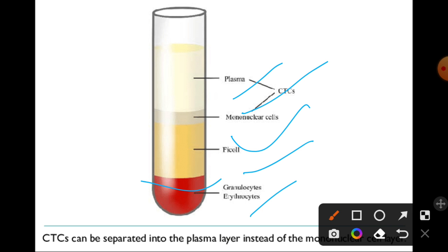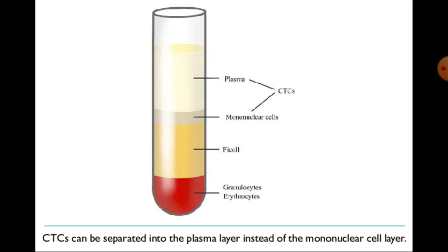And another thing I want to mention here, that suppose in case of plasma, the local density of the solvent is exactly equal to the density of the plasma. Okay, that is kind of the concept we have learned in case of isoelectric focusing, where a protein, when it reaches an area where the pH of the environment matches its pI, the protein stops.